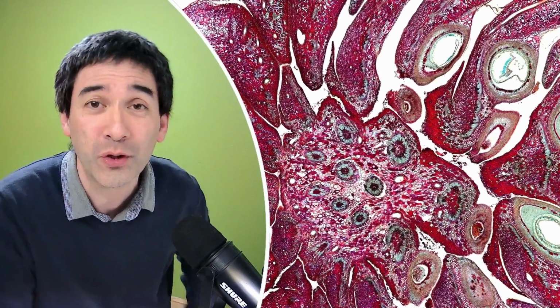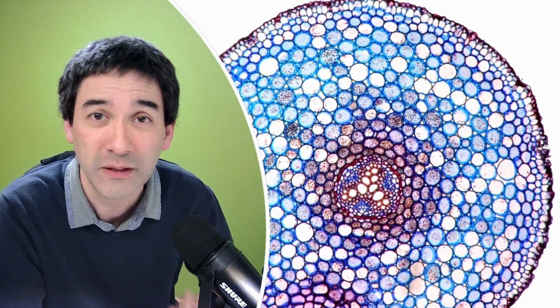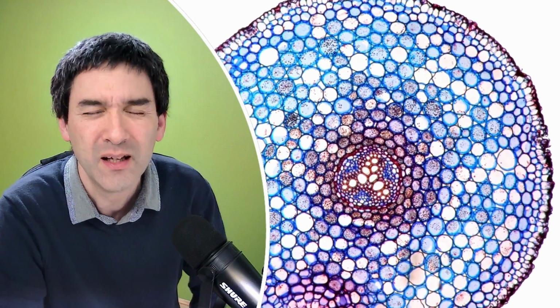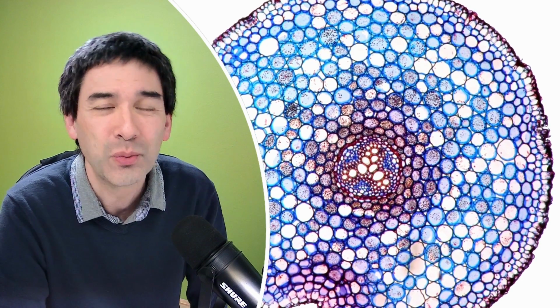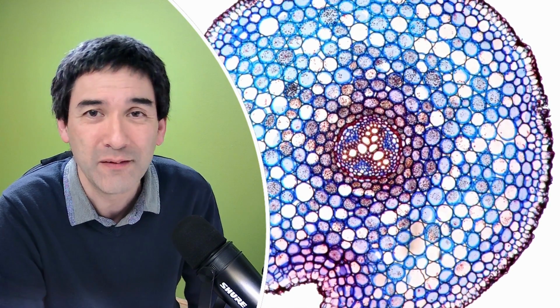Because steam explosions can be quite dangerous. For this reason, those pressure cookers that are also used for cooking food always contain valves and also emergency valves that allow steam to get off in case pressure is too high. Yeah, I'm digressing again. I just wanted to clarify a little bit the importance of these pressure cookers or autoclaves.